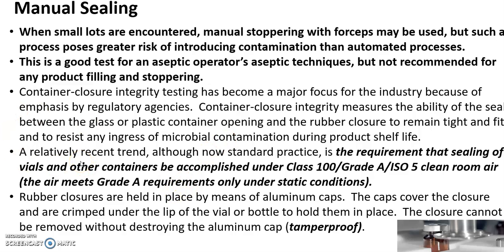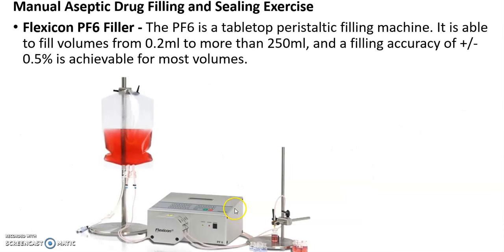And let's see, the sealing, yeah, cleanest environment, and no human interaction is normally allowed. So that's what I just talked about.